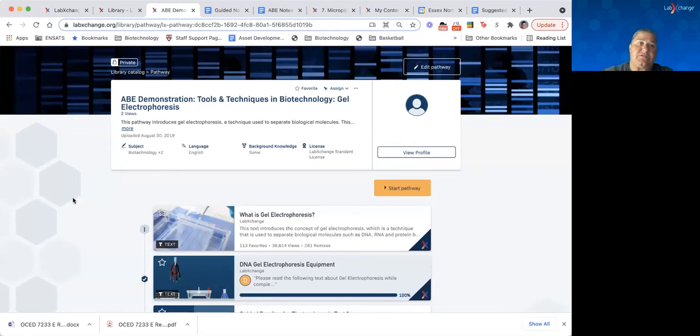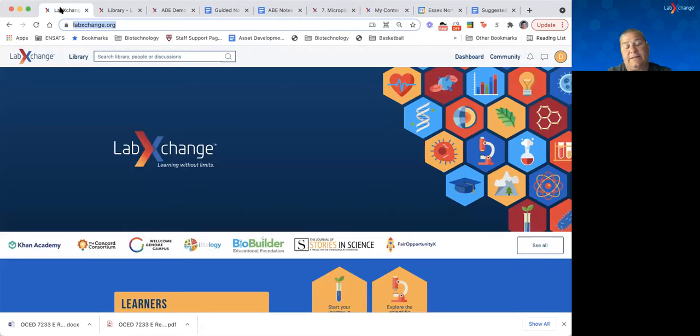All right, so what I'm going to do right now is take you through the gel electrophoresis pathway, so maybe that will be helpful. Let me share my screen, and I'm going to show you how you can customize the LabXchange pre-made pathways to be more comfortable in your teaching environment.